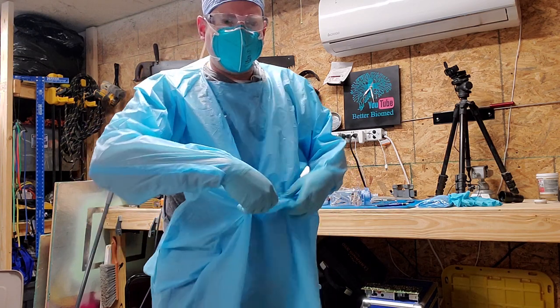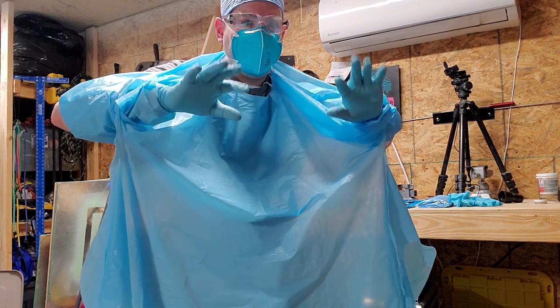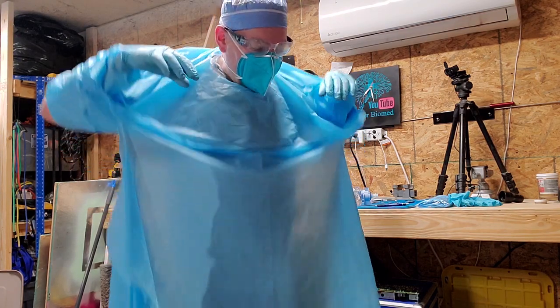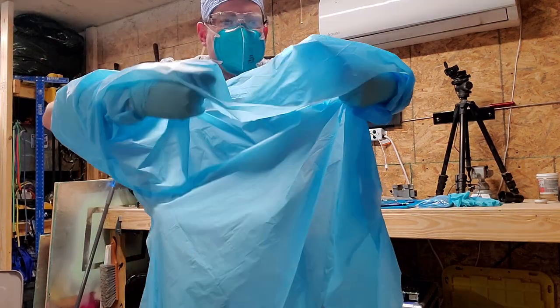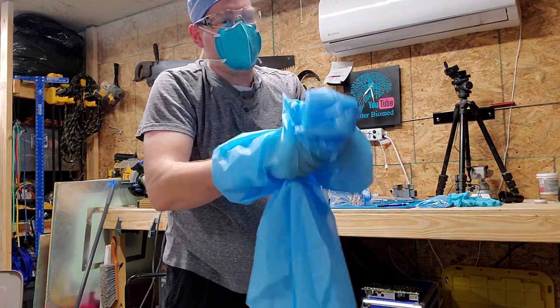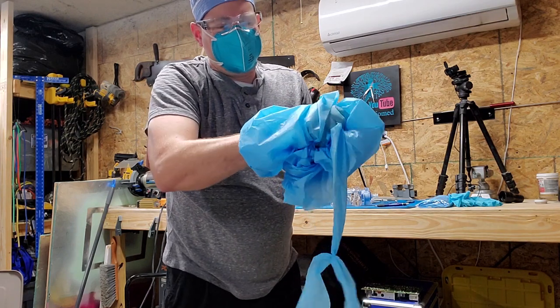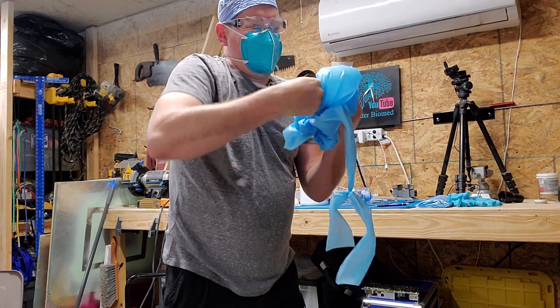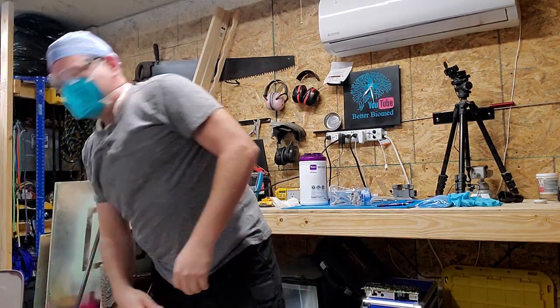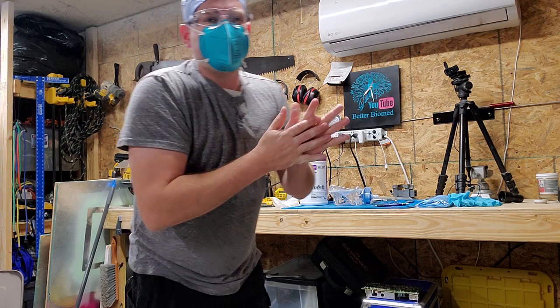So what I do is I break it. I grab it, so I roll it forward. Leave the gloves out here and do not touch around your face. Once you go in the room, you don't touch around your face until you are completely ready to be done. So I take it off like this. Keep the gloves on the bottom and the inside. Just kind of roll it up. Just like that. Okay, so once you have it all in a ball, go ahead and throw it in the trash. Then the first thing that you are going to do is hand sanitize, okay? Do not touch anything else until you sanitize, all right?